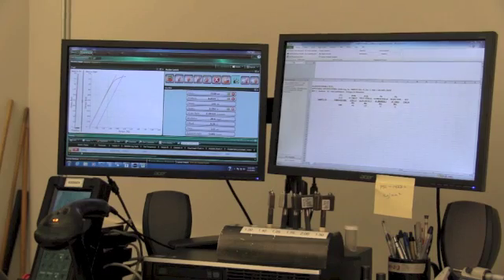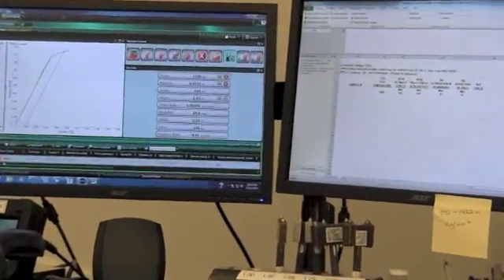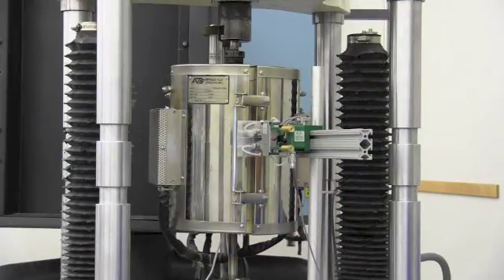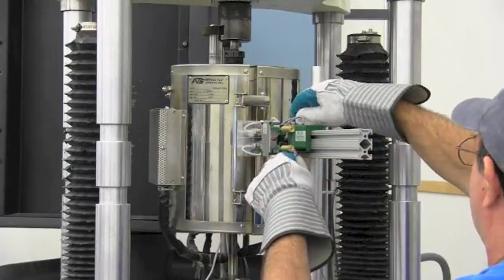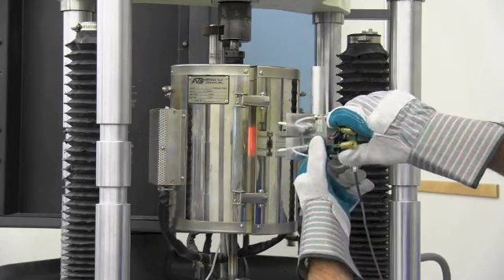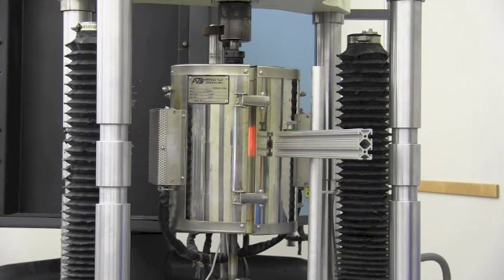The load and strain are recorded by the computer as the load is increased under computerized strain control until the specimen has yielded. Once the specimen has yielded, the extensometer is removed to prevent damage when the specimen breaks. The test speed is increased but still often takes 10-15 minutes before breaking.